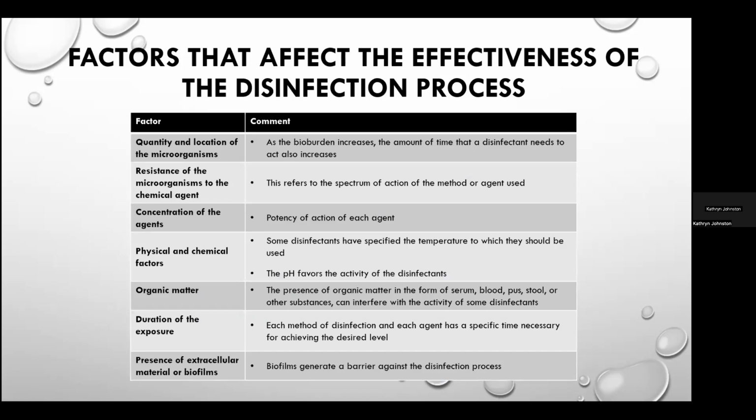The presence of extracellular material or biofilms. Biofilms are very, very difficult to penetrate, and so disinfection is rarely effective against those items that have biofilms forming in them, particularly if there are interior lumens.